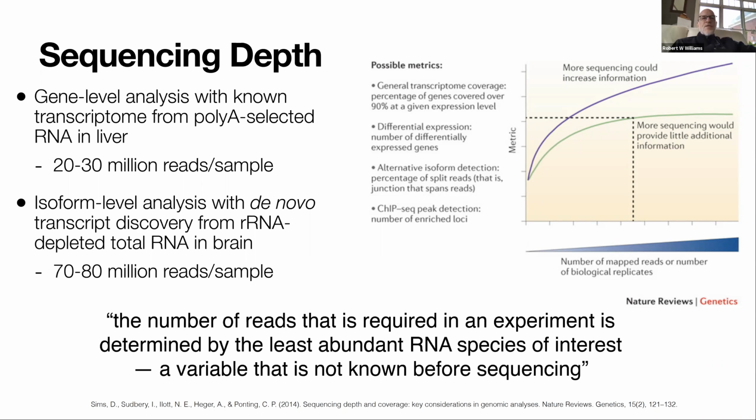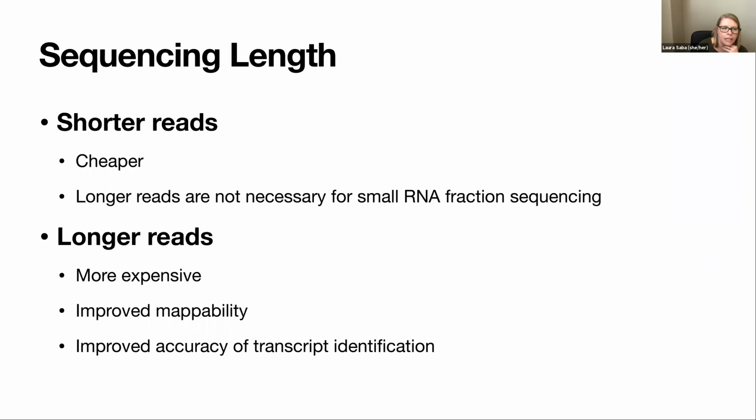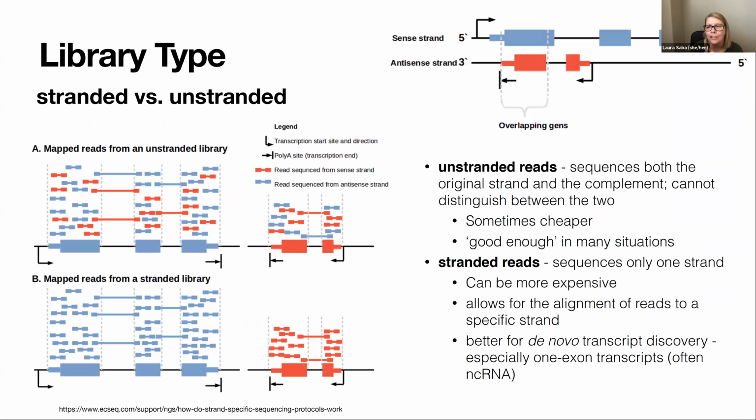Laura, there's a question for you by Malad about the definition of strandedness, whether that refers to haplotypes or the plus or the minus strand in terms of 5' 3' UTR. So it is with respect to the sense or antisense strand, right? So it's which strand that particular RNA is coded from. So it doesn't give us necessarily haplotype structure. Does that help? Okay. Perfect. Thank you.